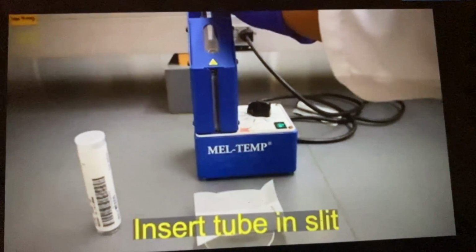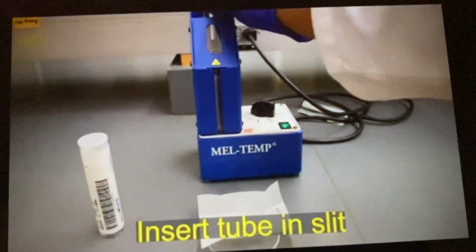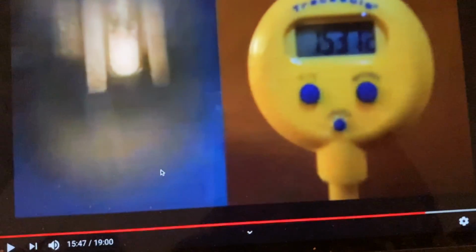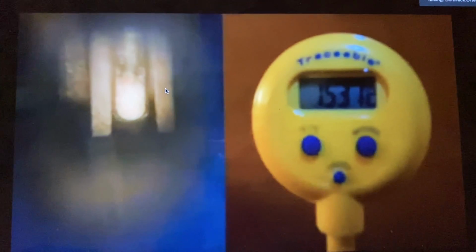Now pay attention to this next part because this is going to be for your melting point analysis. Here at the start, we're at 153, 7.12, I believe. Here's the solid. It's still in solid form, so the temperature is going to increase. This number is going to go up, and you should pay attention to the state of your solid.